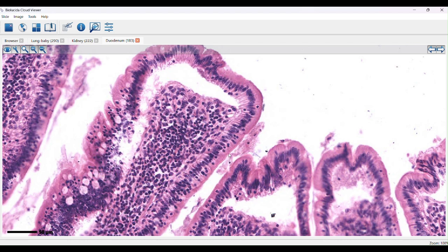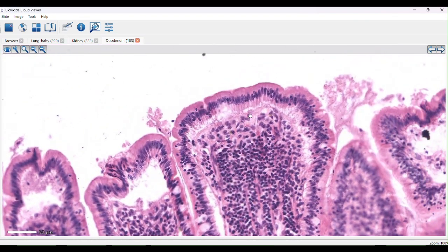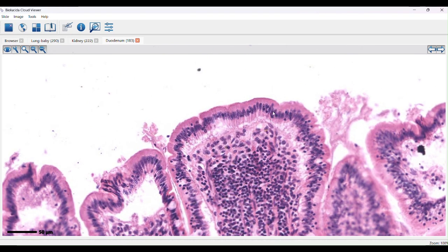This is tiny. These microvilli increase the absorption surface of our intestine. Simple columnar epithelial tissue.